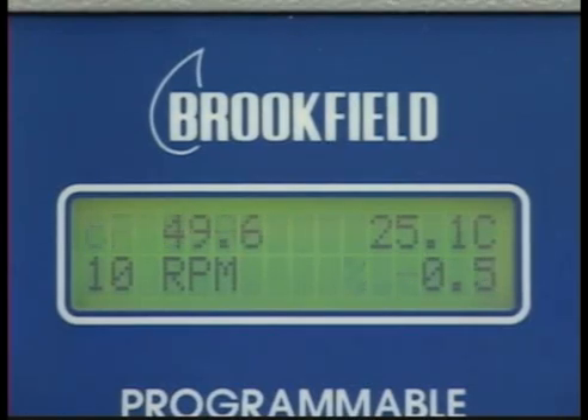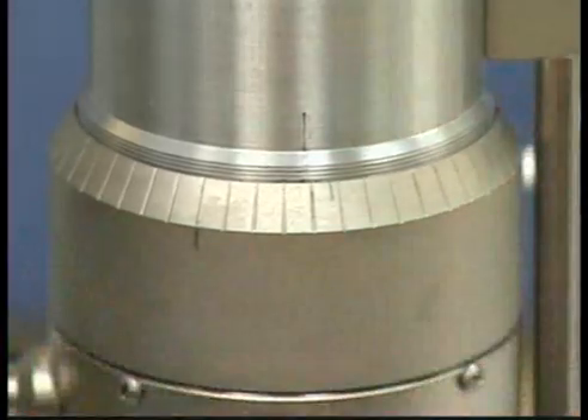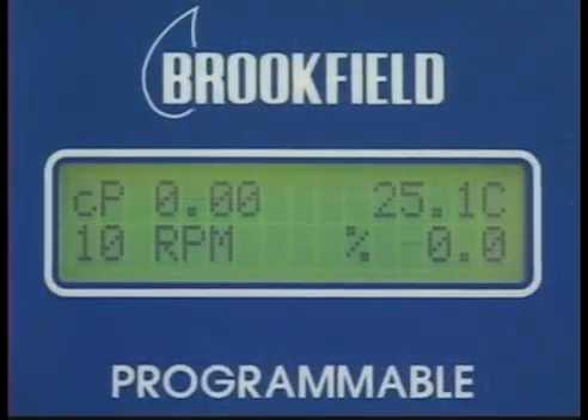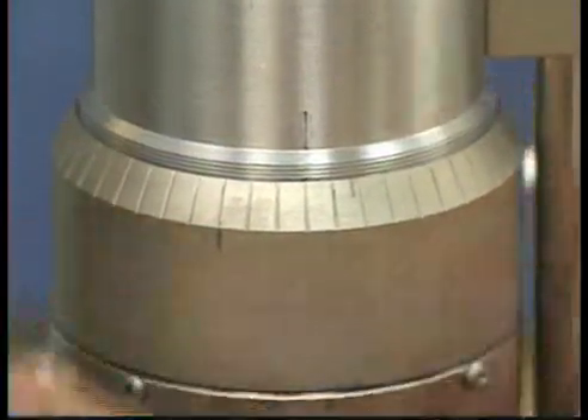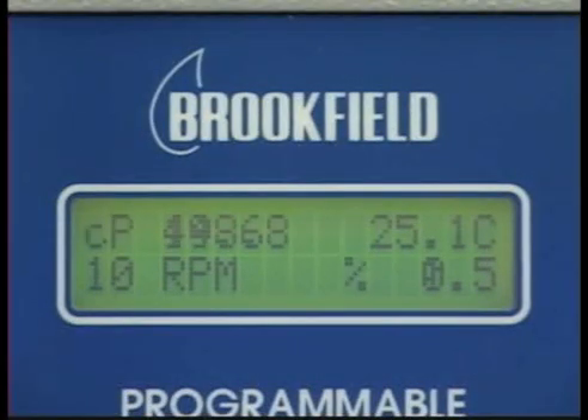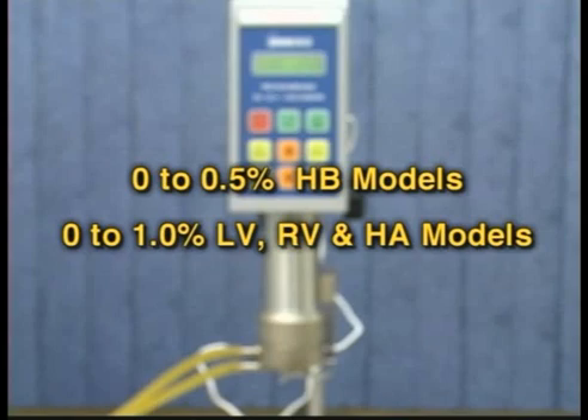If the display reading jumps 0.4% of scale or higher, or will not settle to zero, this indicates the pins on the cone and cup are hitting each other with each revolution of the spindle. Move the adjustment ring by turning it to the left, clockwise, until the percent torque reading settles to zero. Then turn the adjustment ring to the right, counter-clockwise, in small increments while watching the viscometer percent torque display. Wait at least six seconds between movements of the ring. Keep turning the adjustment ring until the display jumps from 0 to 0.5% for HB models and from 0 to 1.0% for LV, RV, and HA models. This is the hit point.